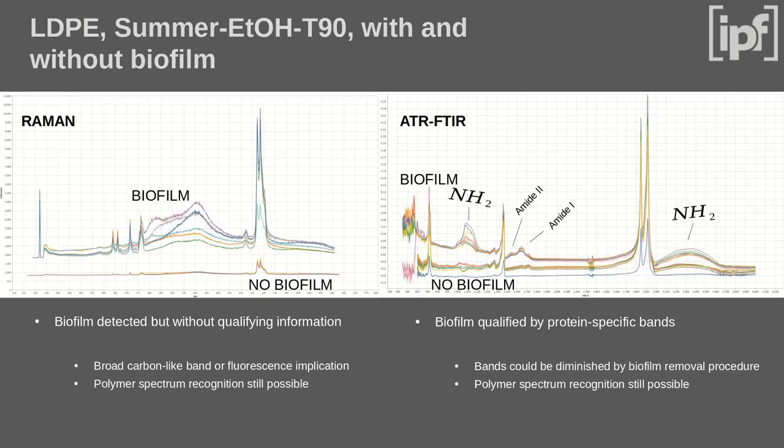Yeah, what we mostly saw in the result of this activity was that there were many sheets where the spectra looked very similar to the original spectra. There were some where the spectra were completely off, so they would not be recognizable, also not by a human spectroscopist, to say this was this material. And then there were some in between, and these are the interesting ones because they can then be used to enrich spectroscopic libraries that are used for matching microplastic potential particles to reference materials.